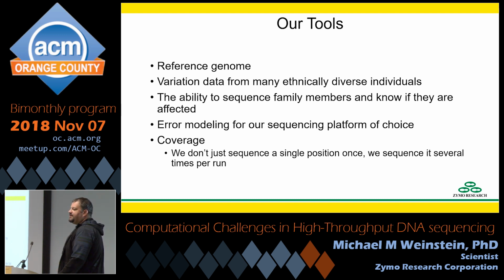Plus we have something called coverage. We're not going to sequence everything just once, we're going to sequence everything several times, or at least our regions of interest. Everybody here has 2 copies of their genome, one from mom, one from dad. If you just sequence every base once, you will only see one of those copies at any given location. If you sequence every base in your genome twice, at about half the sites you'll see a read from both copies. At half the sites you'll see reads from one or the other. So still not very good.